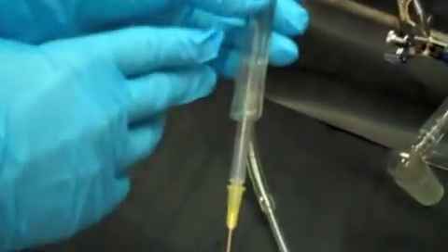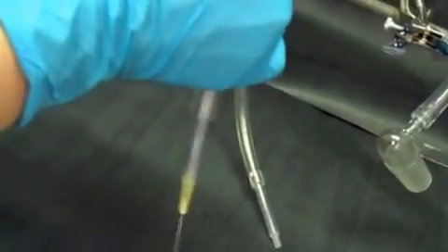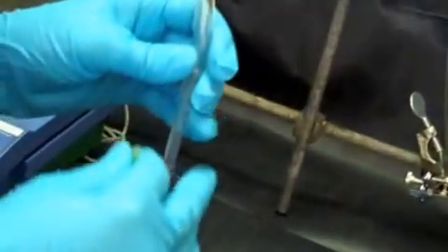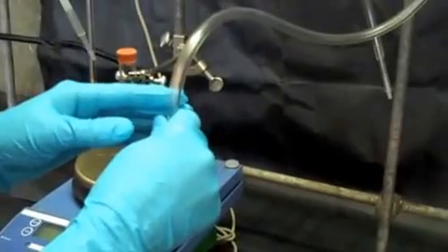For the previous demonstration, note that we were using vacuum, so we were using a thicker walled Tygon tubing. Because I'm not going to use vacuum in the purging method I'm going to show you, I'm going to switch to this more pliable line. This is thinner and easier to manipulate, and once you put it into the reaction, it doesn't move on its own so much. So it's good to use when you're only using nitrogen.